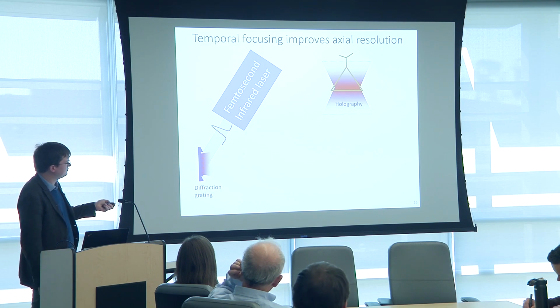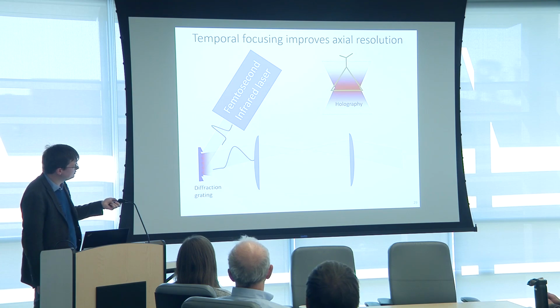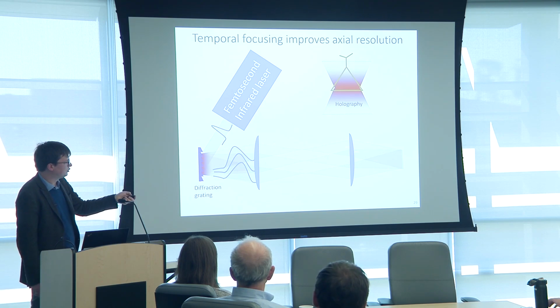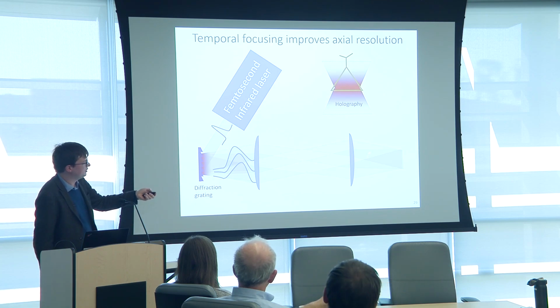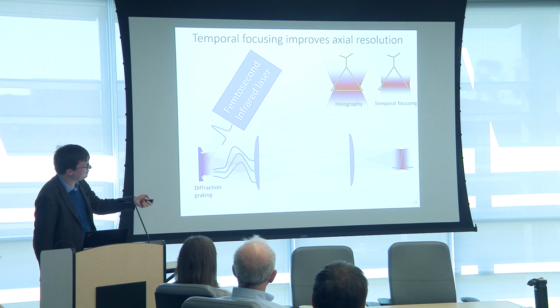If you break this pulse on a diffraction grating, you will split the pulse into colors, and each of the colors can propagate on a separate path. And this is another 4F system. If you use a 4F system to replicate here the field over there, on each of these paths, the photons are propagating in pulses that are very narrow in color, therefore broadened in time. But as all these multicolor pulses interfere constructively right here, when they all meet at the focal plane, they recreate the pulse that is narrow in time.